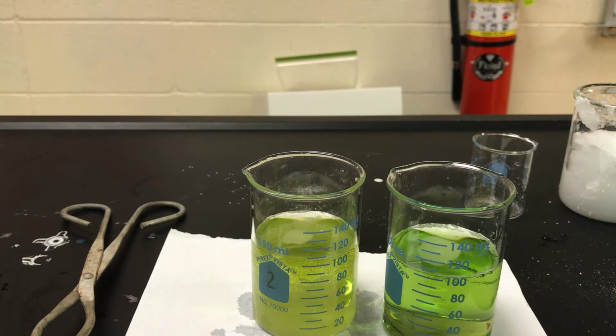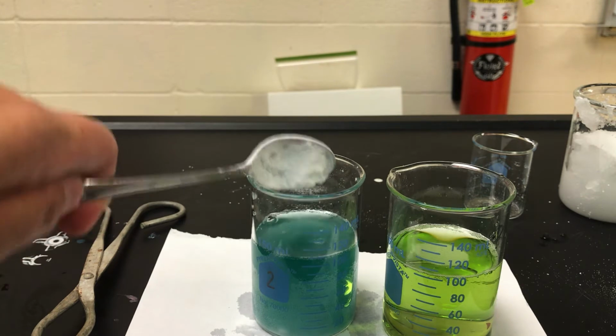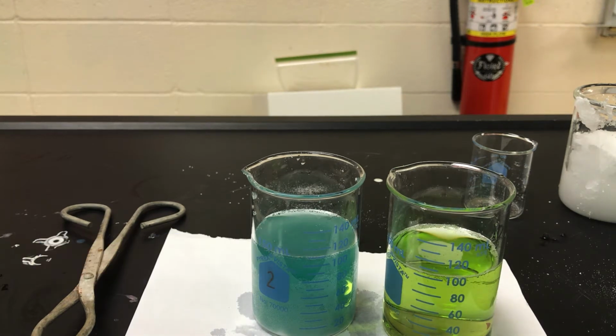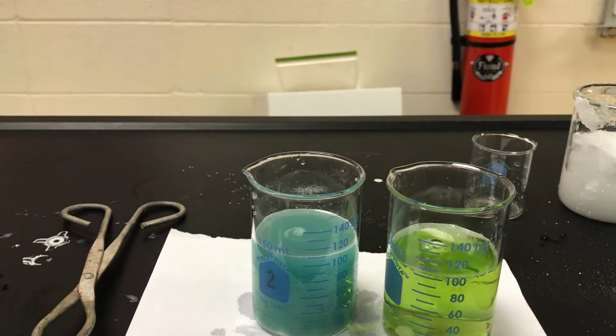Sodium bicarbonate, also known as baking soda, is going to go first. We'll note that there is an immediate color change. And then we are going to put some calcium carbonate, commonly known as marble chips, into the beaker on the right. And what do we observe?